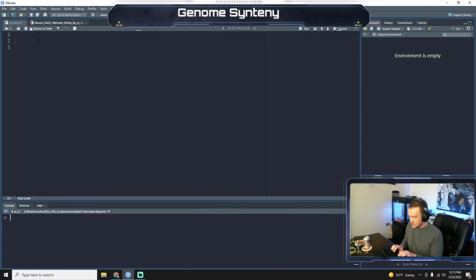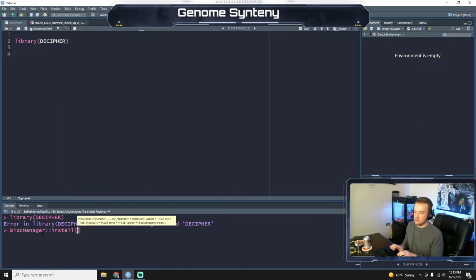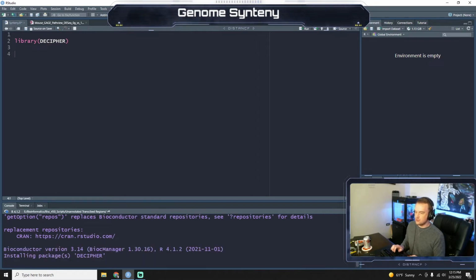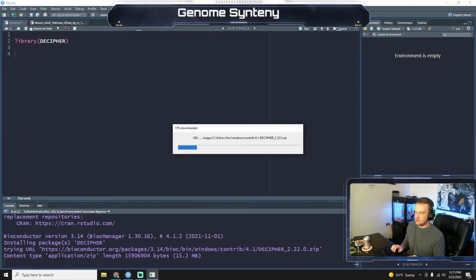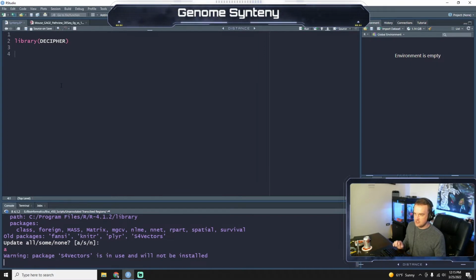Okay, so first thing we're going to do is load our script. We're going to load the DECIPHER package and run that. No package called DECIPHER. I've been having this problem a lot, haven't I? BiocManager::install, some quotations there, DECIPHER. Update all the dependencies.